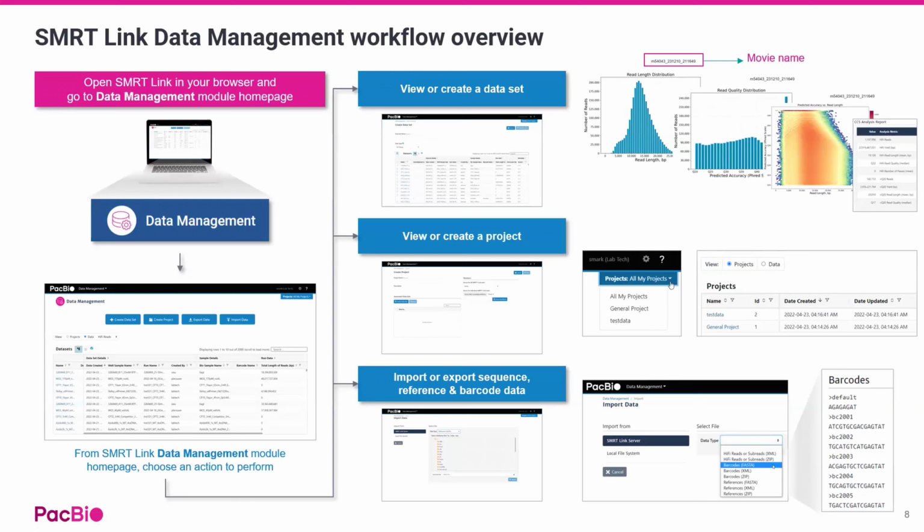The data management module enables users to view QC information of all sequenced and/or imported data sets, barcode FASTA files, reference files, and target bed files. Each dataset contains QC metrics regarding total sequencing yield, quality scores, and HiFi yield. PacBio datasets are all uniquely named by their movie name, which consists of the instrument serial number and date and time stamps. The combined QC information can be exported as PDF for user retention.